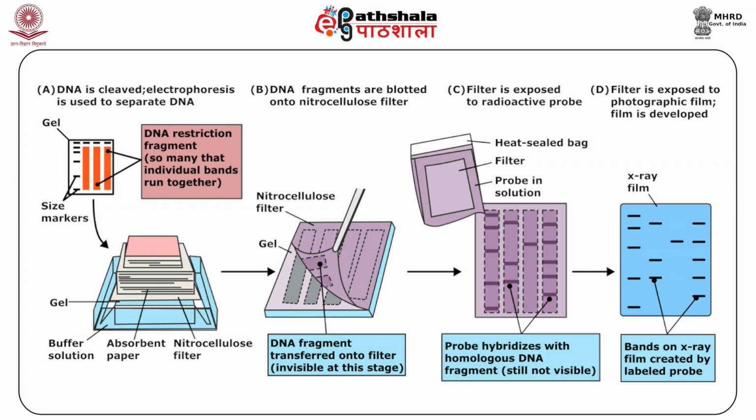Blots can then be probed using a radioactive or a non-radioactive DIG labeled probe. This probe binds to the target DNA fragment and helps in detection of such sequences. The hybridization reaction involves a buffer, a detergent, and a non-specific DNA to maximize the stringency. The membrane is washed with the buffer to minimize any non-specific binding.